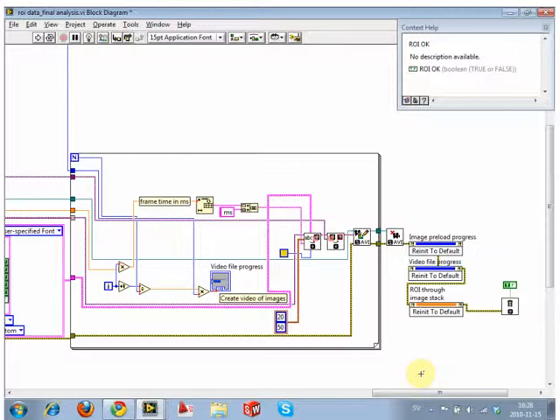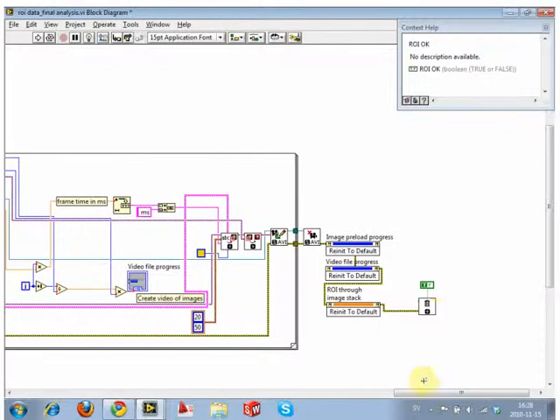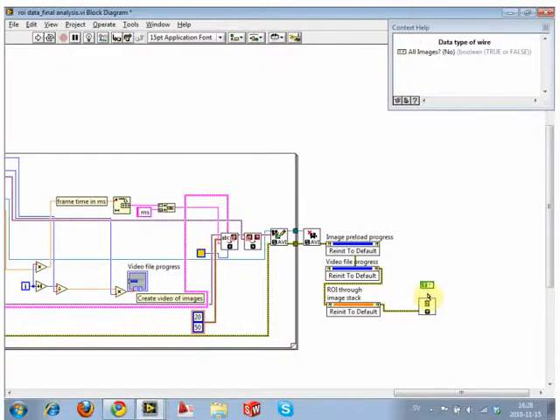It's kind of like this where I'm saying destroy all images. It's a good failsafe for me not leaving data hanging around. I could have a wire for every single image that I call, but at the end of the day I might miss one. Whereas having this means it doesn't matter anymore. I'm just wiping them all out.